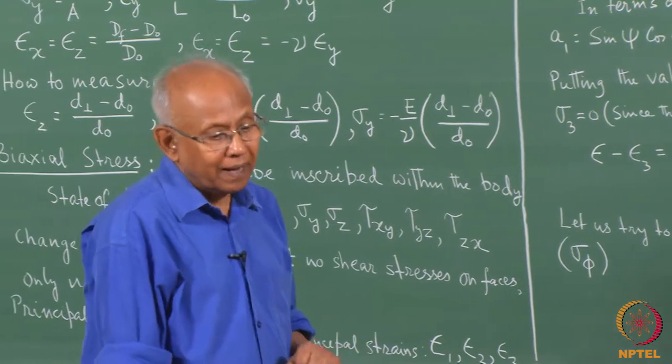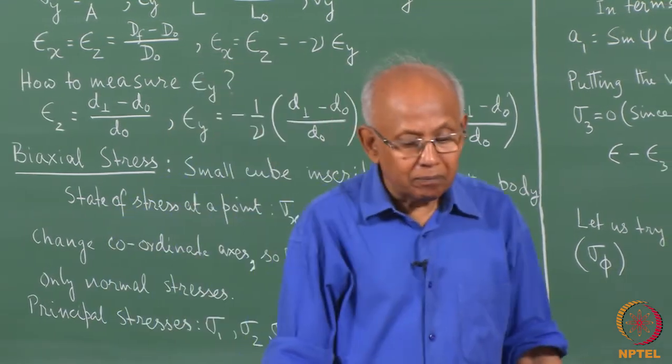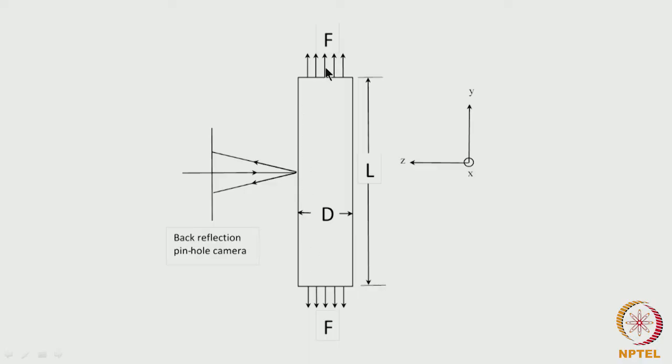However, the problem is when the rod is under tension as shown over here, we cannot measure the interplanar distance of the planes lying perpendicular to the direction of F, because it will be difficult to put an X-ray equipment over here.